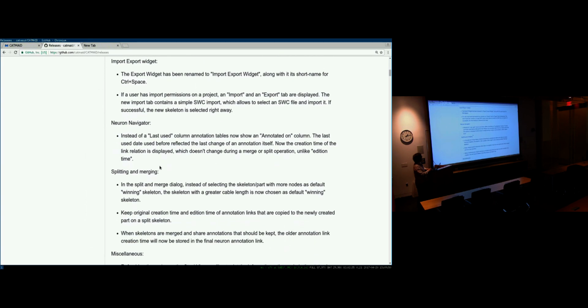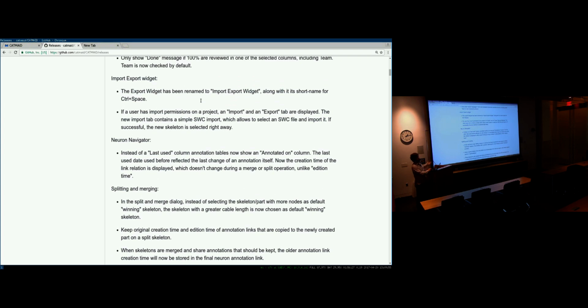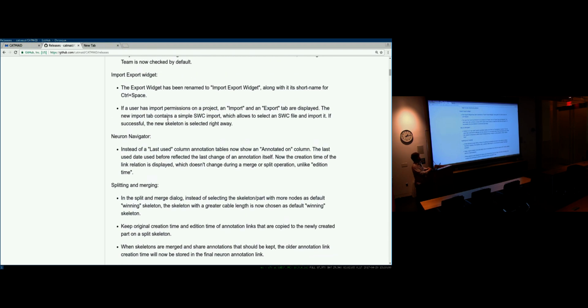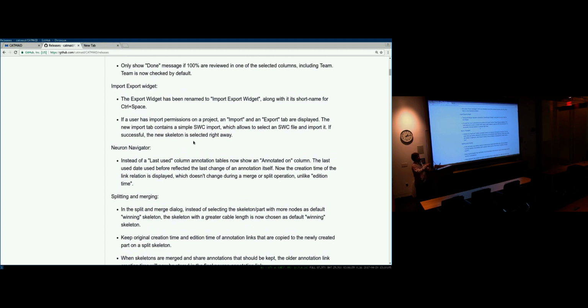OK. So beforehand, the import was only accessible through the API. I don't know if you ever used that, but this also now requires this particular import permission to actually do that. I only say this because Ruchi asked me to try importing some neurons from the main FAFB instance to the training instance to maybe get a better example of a particular neuron that now has been reconstructed. And this makes use cases like this easier.